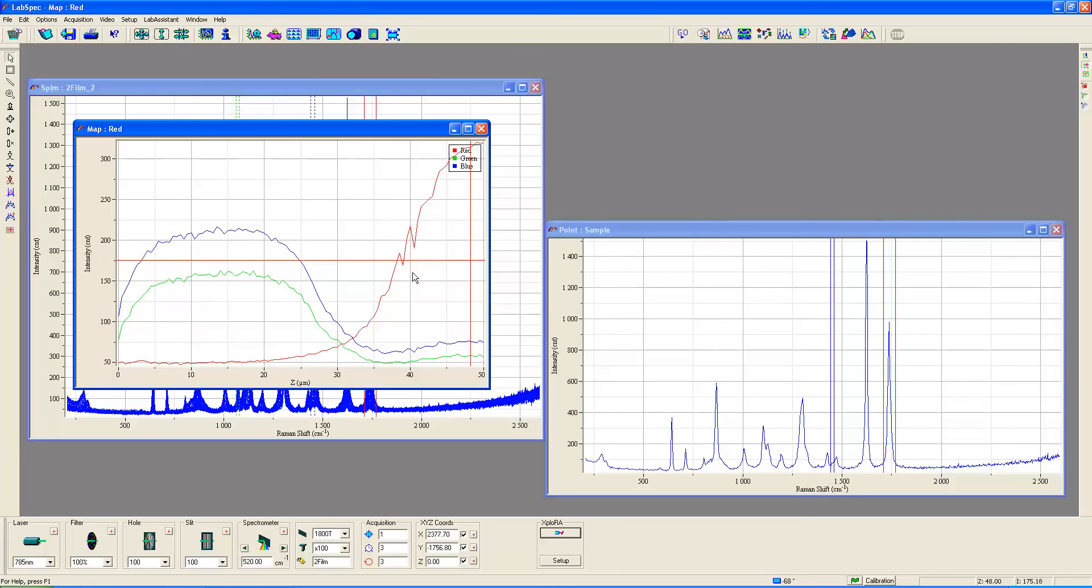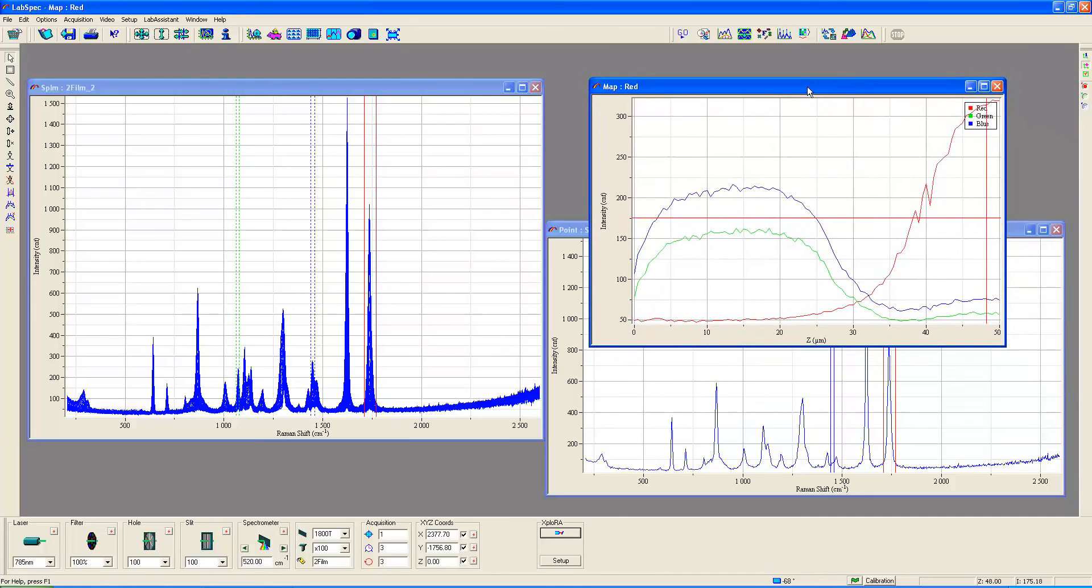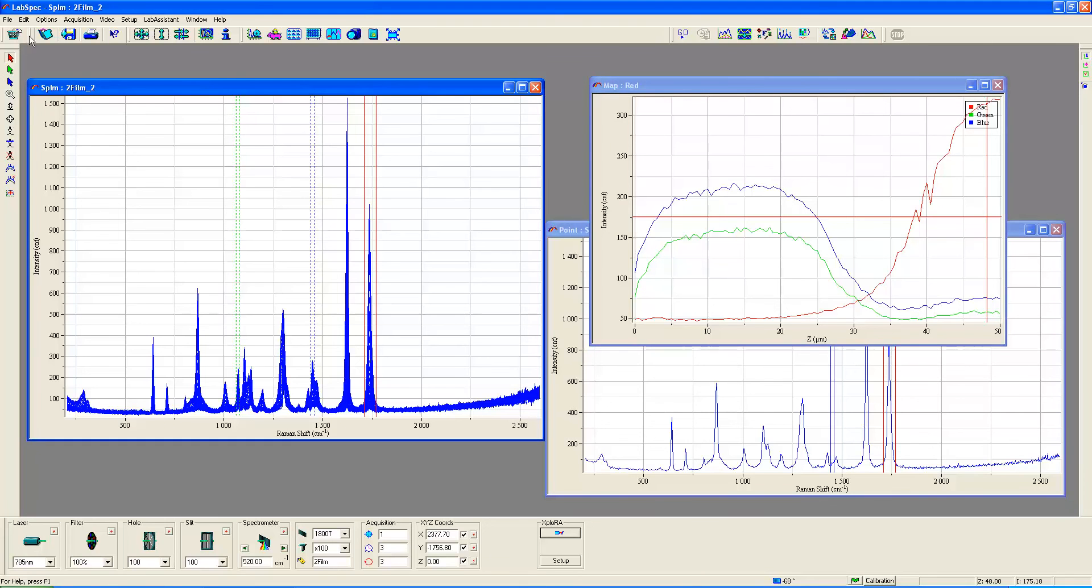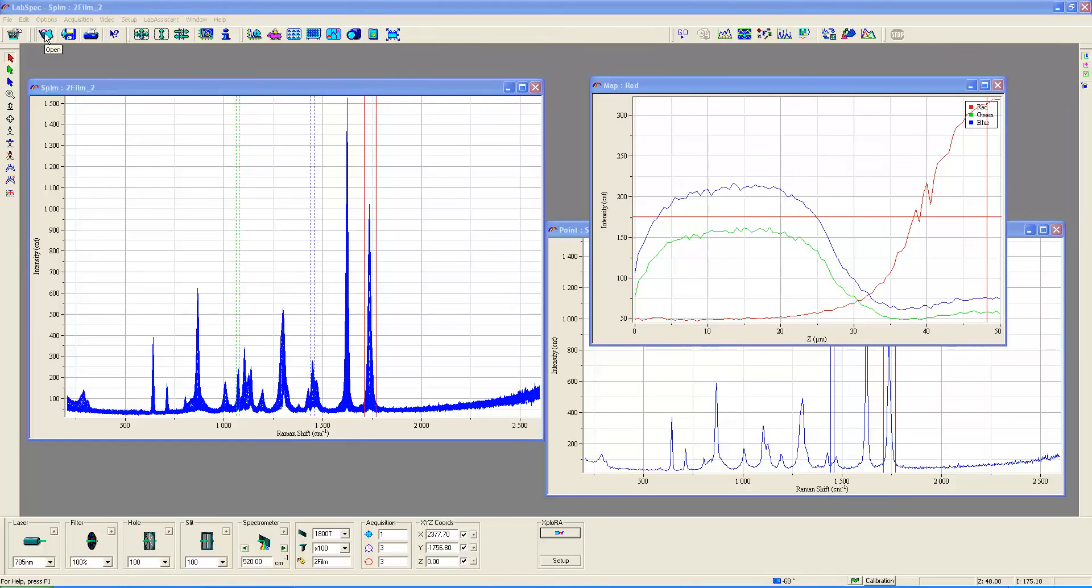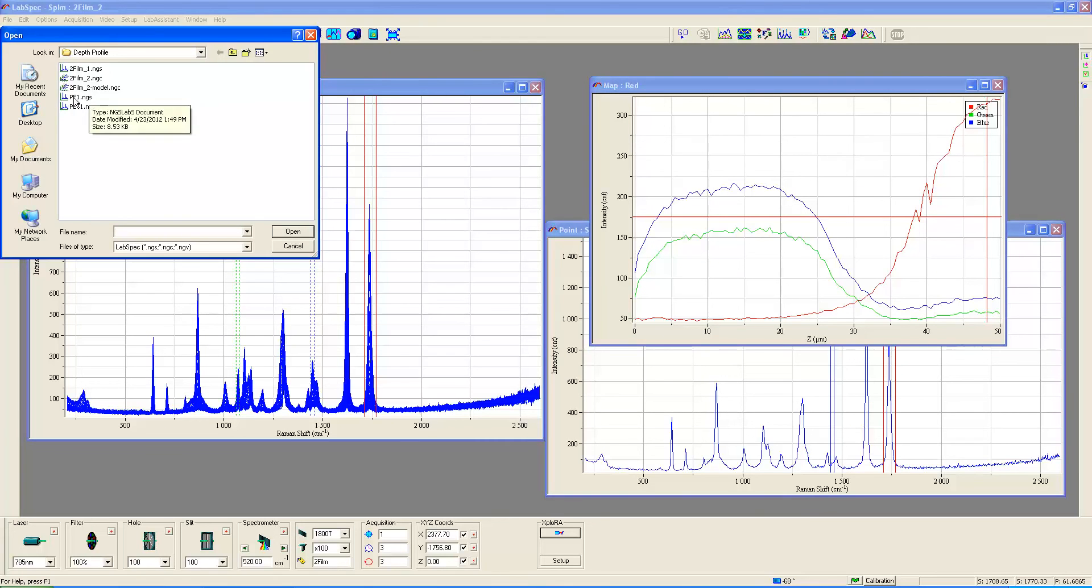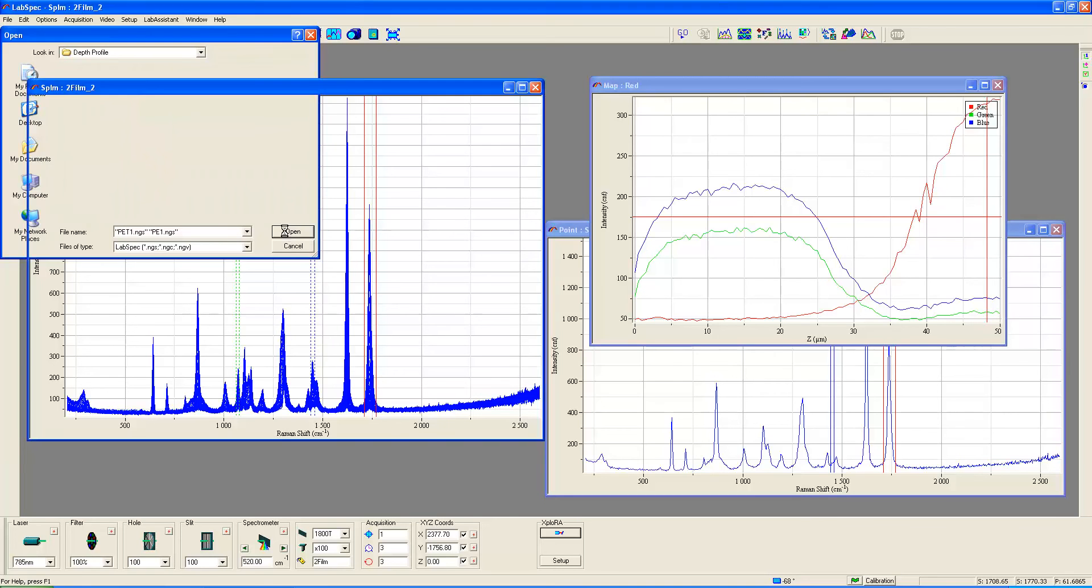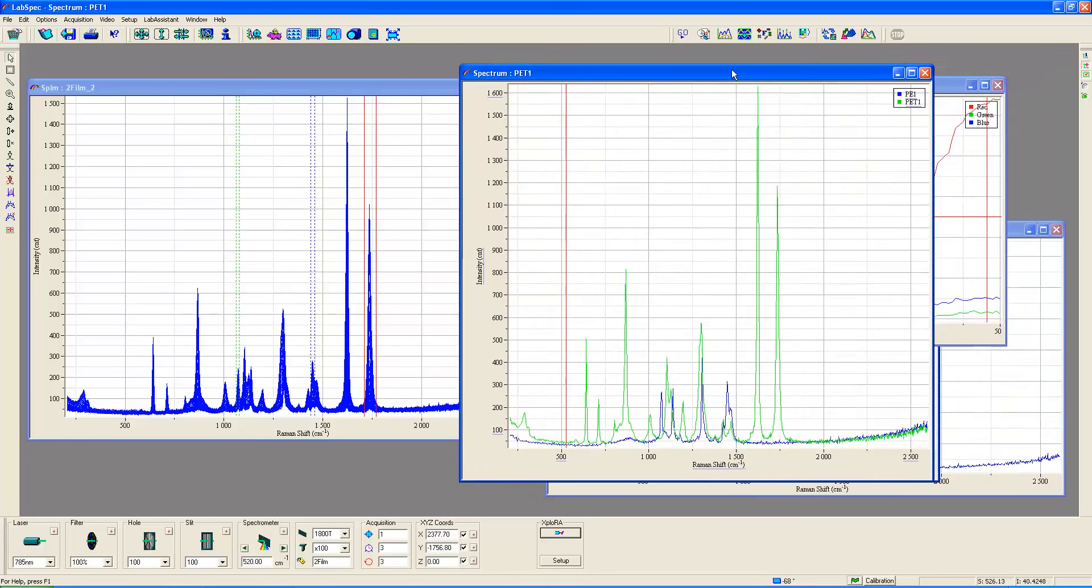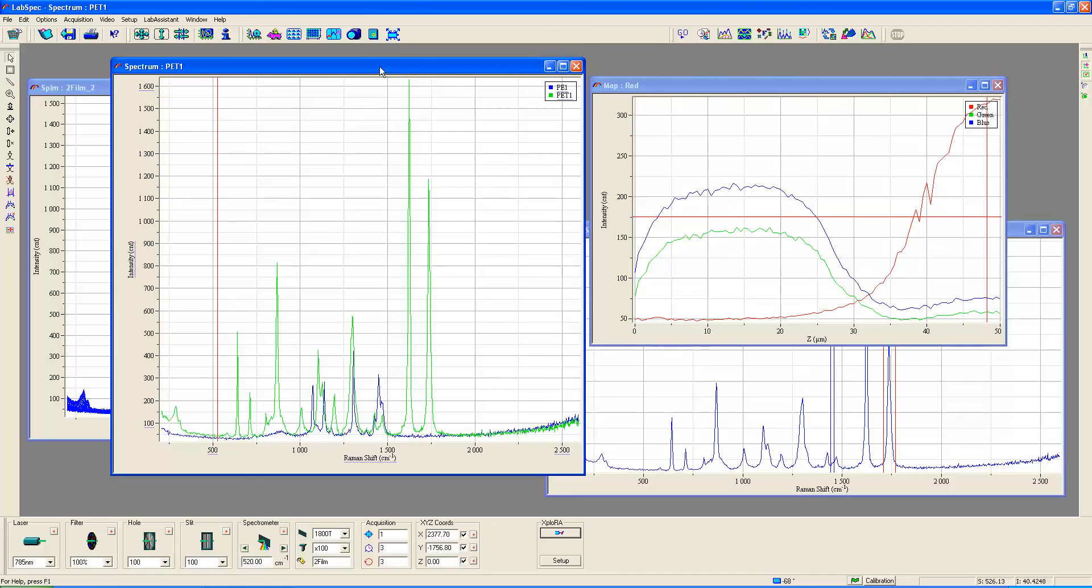Now we've looked at this depth profiling by peak area, by selectively picking off peaks that are associated with this material, but we can also get a profile by modeling as well. I'm going to open up two spectra, my reference spectra acquired of these films from which I made the multi-layer and I acquired these spectra separately. Here you see the blue spectrum is polyethylene and the green spectrum is polyethylene terephthalate, these are my reference spectra.